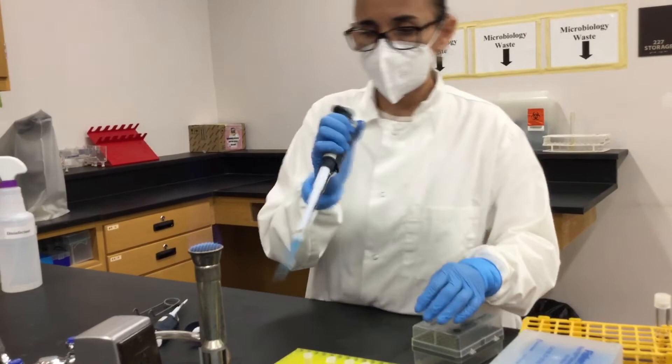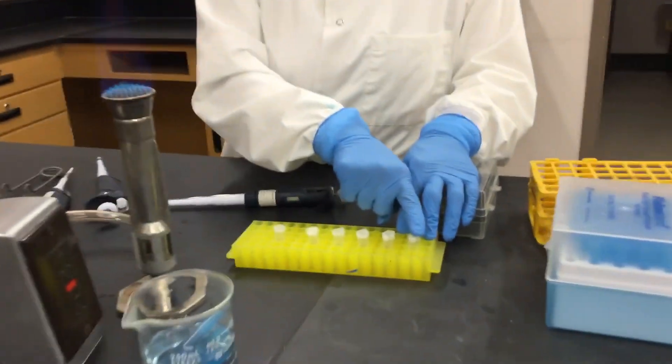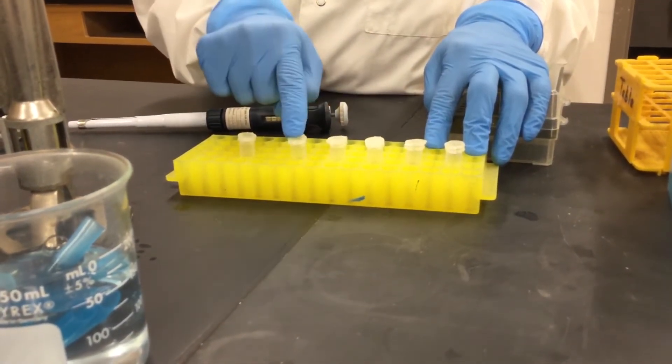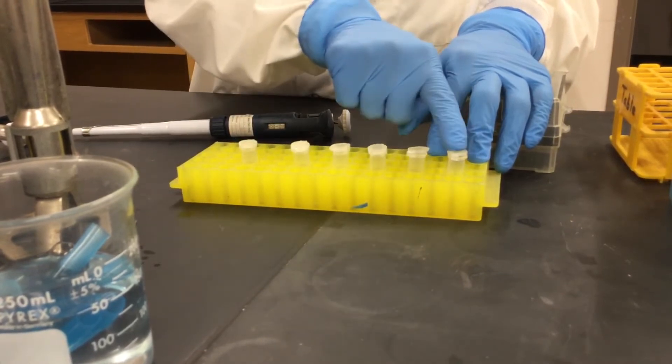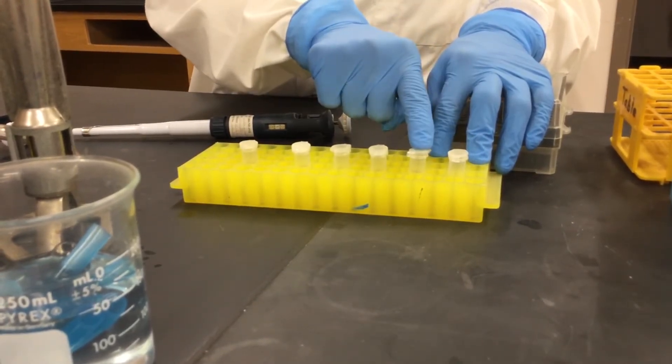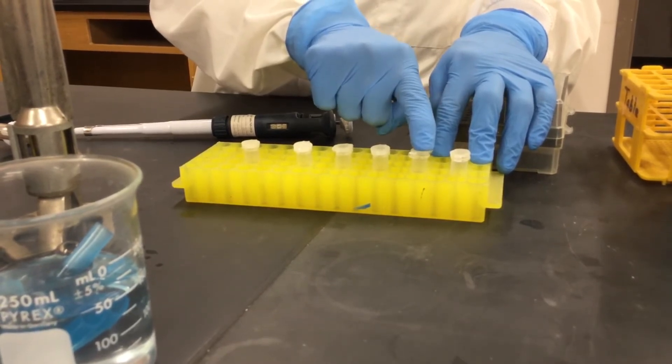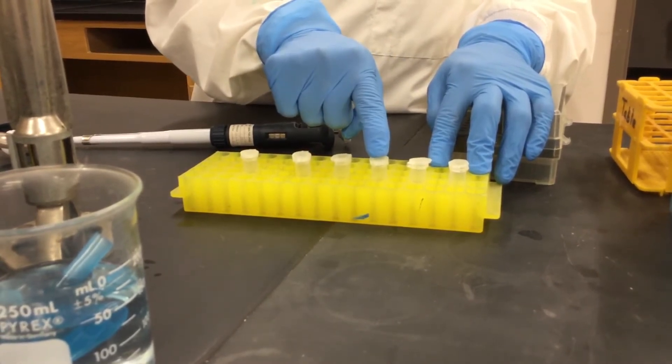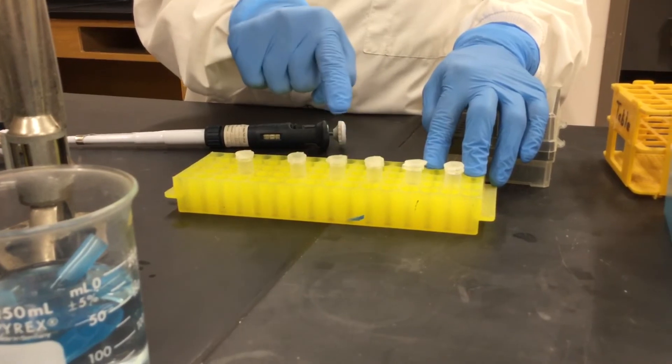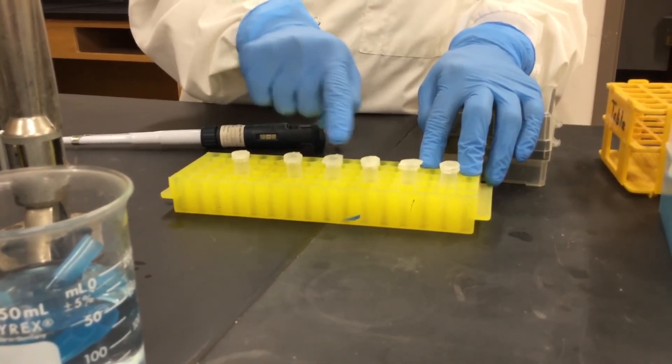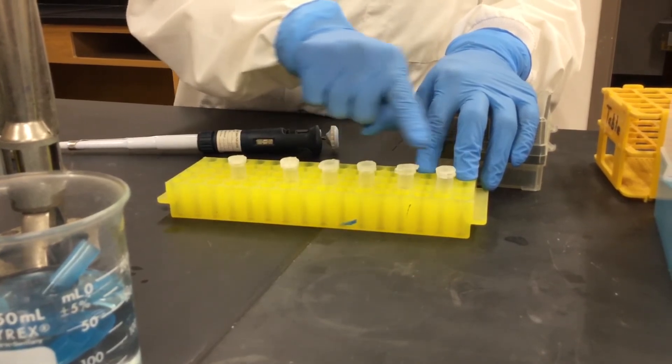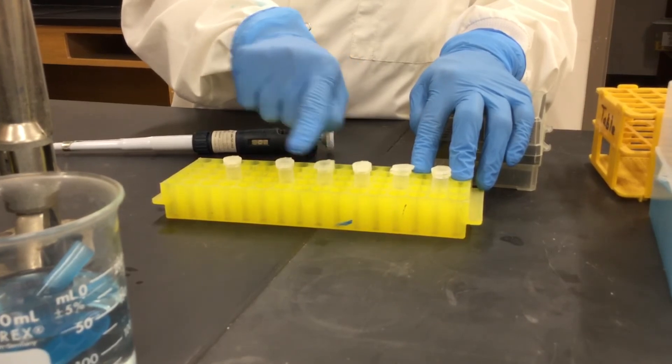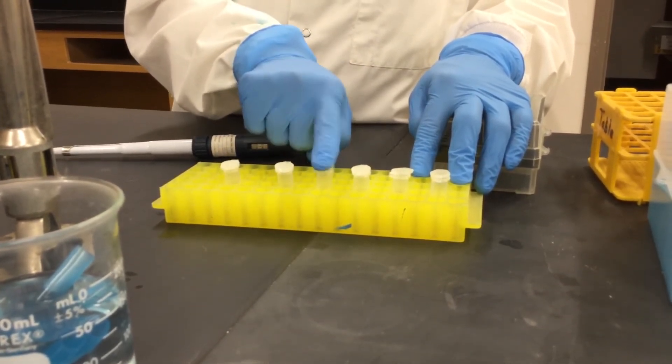So here this is what you have: this is original inoculum, this is 10 to the minus 2, 10 to the minus 4, 10 to the minus 5, 10 to the minus 6, 10 to the minus 7. So from here to here, transfer 10 microliters into 990 microliters of water, and then from here you transfer 100 microliters into 900 microliters of water. So in here you have jumped from 1 to 100 dilution into 1 to 10 dilution, and then this is going to be 10 to the minus 5, 10 to the minus 6, 10 to the minus 7, and then you keep transferring.